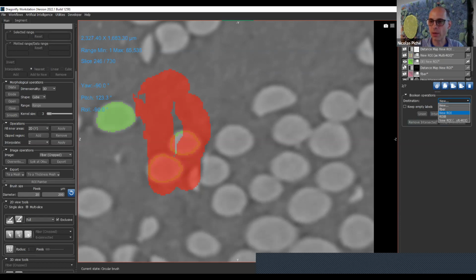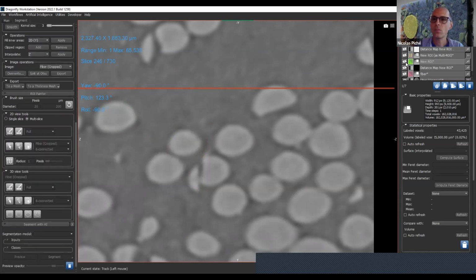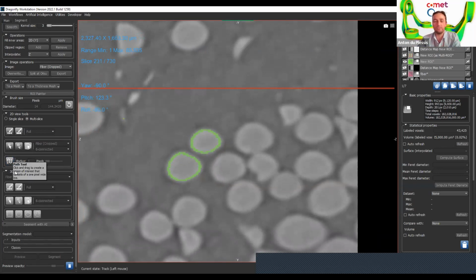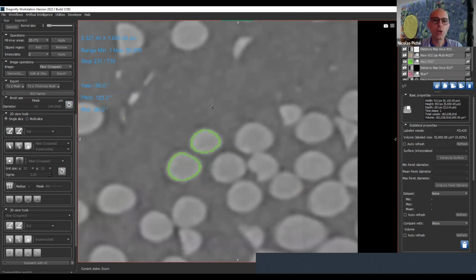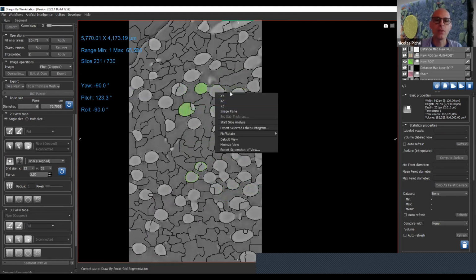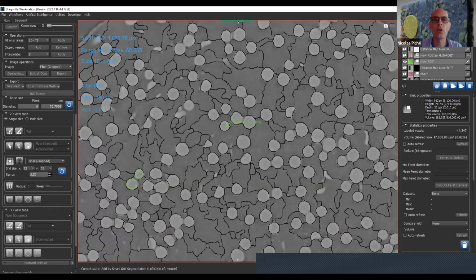Something that Anton likes very much is the grid drawing. So, smart grid. Yeah, smart grid. Okay. Oh, it's in 2D. I select. Okay, so this is an automatic watershed on a grid. It's like painting a mandala, but without the trouble, and it's almost as fun. So I will put myself in XY just to show you again. And so the grid is in fact a watershed on a grid.